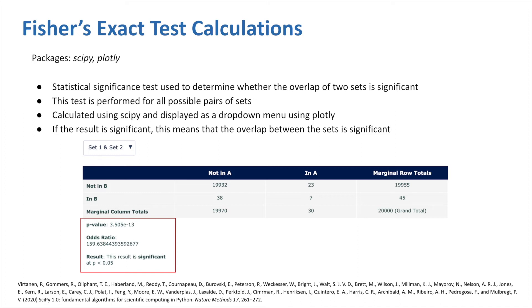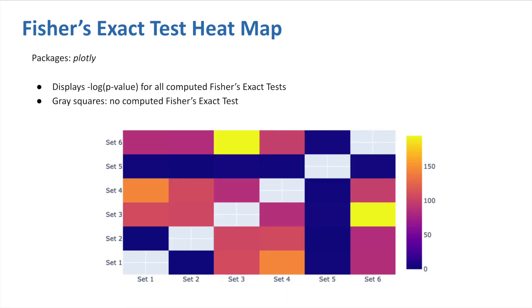With an odds ratio much larger than 1, the association between the sets is strong. If we get a significant result, this indicates that the overlap among the sets is significant. To consolidate all the calculations from Fisher's Exact Test, a heatmap is produced to view all the possible overlaps within a single figure. This displays the negative log of the p-values that were computed. The empty squares show the non-important overlaps, since it's not helpful to check the overlap of a set with itself.